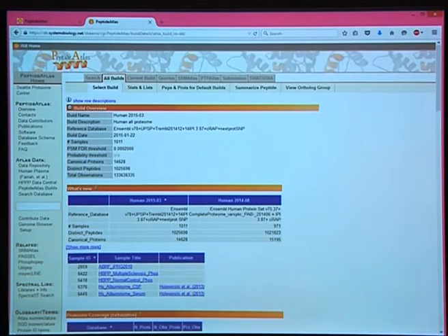If you look at all the peptides we see with high confidence and you map them to proteins, you will say, okay, we map to 17,000 or so proteins. But some of those proteins do not have unambiguous evidence. So this is a very conservative view. These are just proteins that we've seen with at least 2 peptides, and each of the peptides has to be 9 amino acids or longer. We don't even include shorter peptides, so it's a very rigorous look at how many we've seen. I'll show you evidence that this number has, in essence, plateaued.